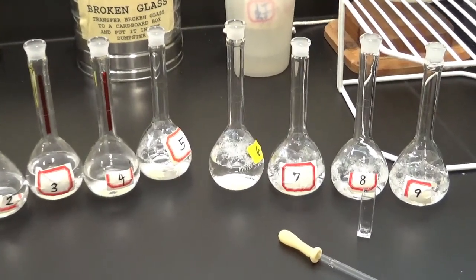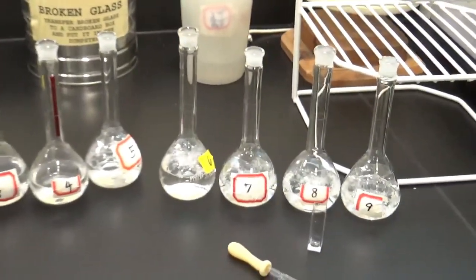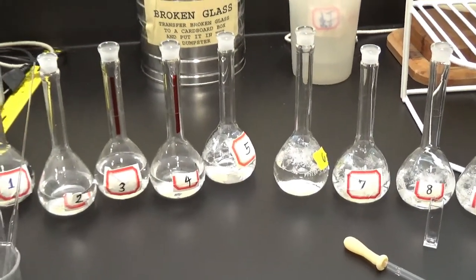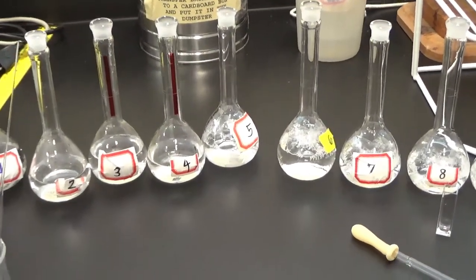So maybe I'm aiming for like 900 or something. And then for the successive solutions, they will only be lower than that. There might be some fluctuation though, so I don't want to set it to 1,000 because maybe the next one will be 1,010 and I don't want it to be cut off.